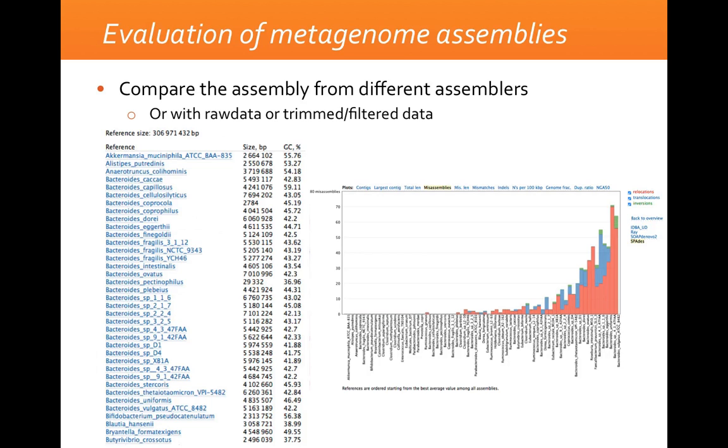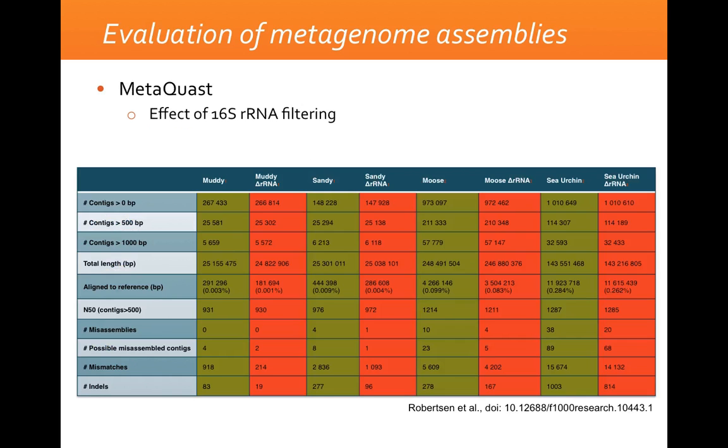And then of course, you will also try to run the assembly on quality trimmed and filtered data and on raw data, and you can compare which produced the best assembly from that.